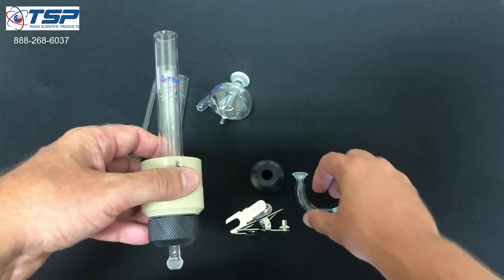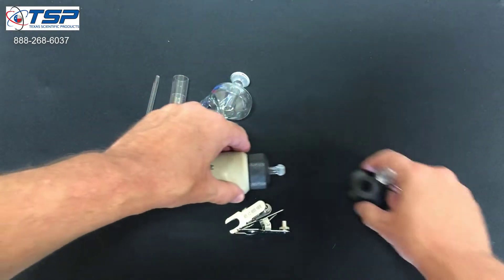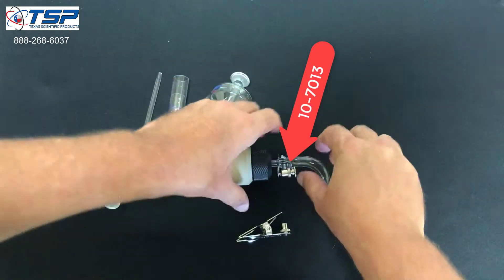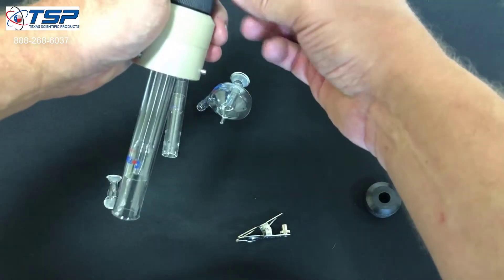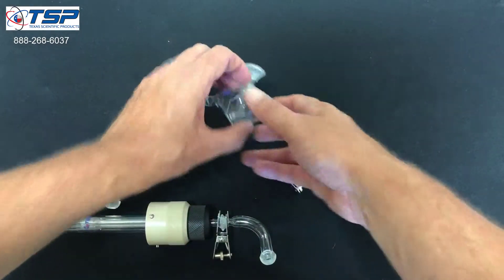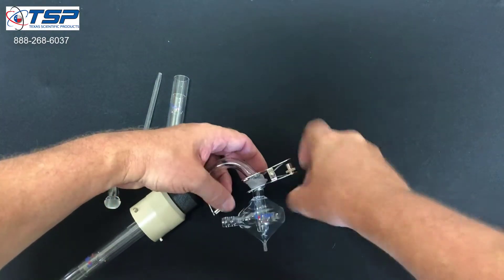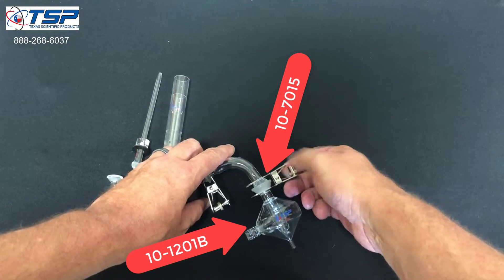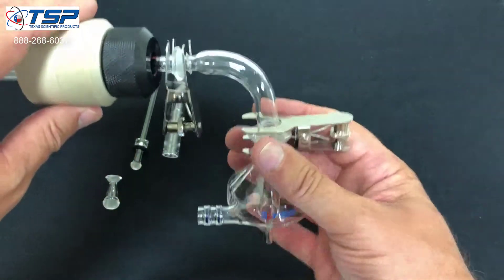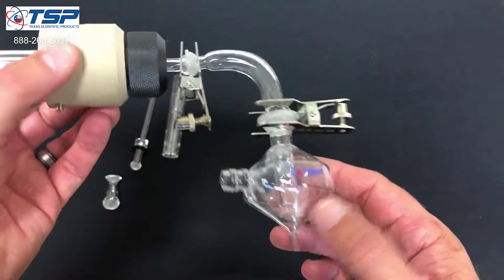Getting it connected back to the spray chamber is the same process. We've got an adapter here, the 12-5, and we'll take the small clamp. Then we've got the spray chamber and we'll go ahead and tighten that up. At this point, we're in good shape to run the axial setup on the MV.